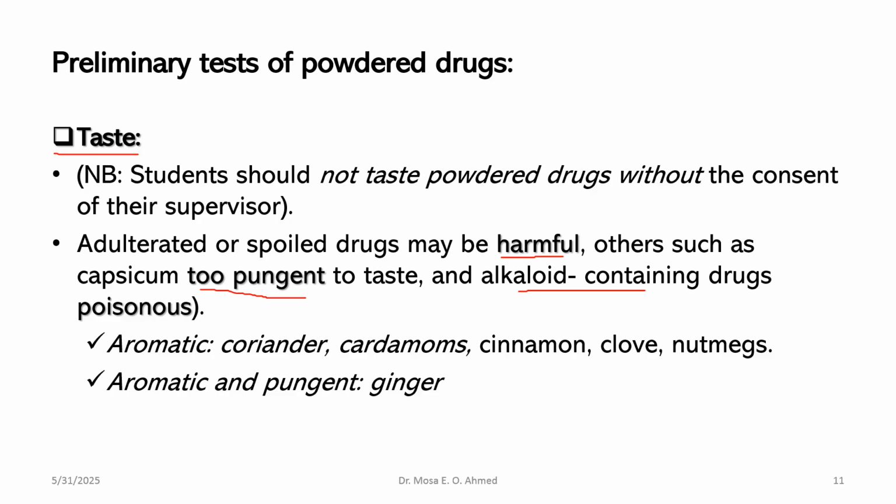So the student should not taste any drug without the consent of their supervisor. When in the lab, you are not allowed to taste any powder sample unless you consult your supervisor or the demonstrator.